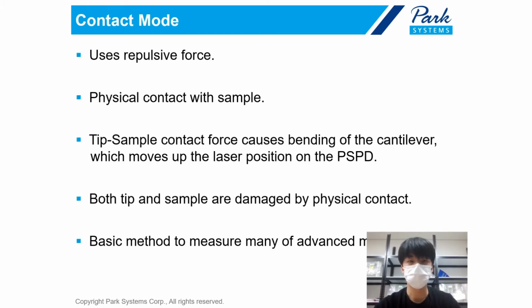Summarizing the contact mode, it uses the repulsive force for feedback, and the tip has physical contact with the sample, which can damage both tip and sample. Force is used as a set point in contact mode, and the feedback maintains that constant force by moving the z-scanner.